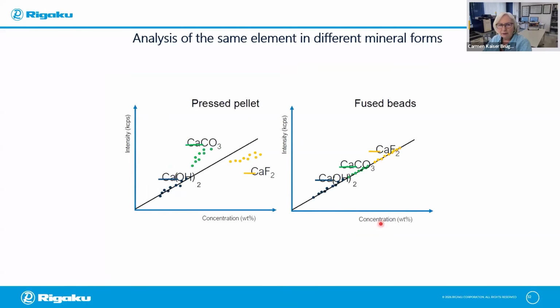So yes, very briefly, we have the challenges with the pressed powder method in XRF, because we have matrix and we have mineralogy. And because of this, we have different groups of calcium in these matrices, and therefore we have the challenge of different curves. But if we have the fuse bead method, which is more costly for the mining laboratories, this is not the ideal situation where they want to be. But of course, they can have this as a reference method to check and verify from time to time.